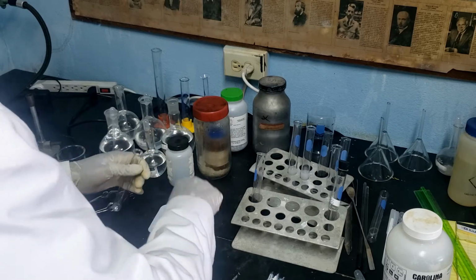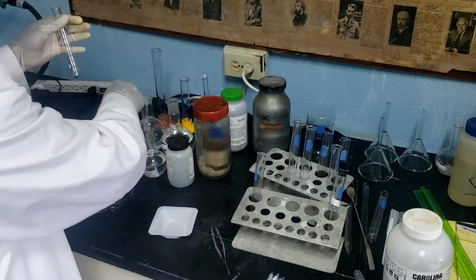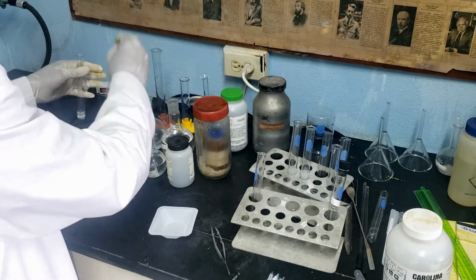The next step, the metal is removed and then submerged in more hydrochloric acid.